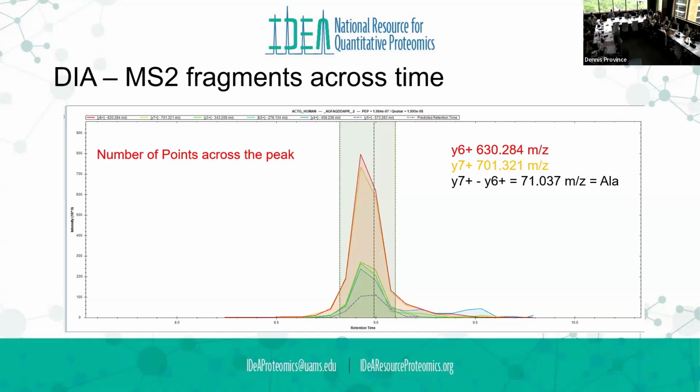So that's identification, but then we're also quantifying by drawing a sort of Gaussian curve across there. So the question in DIA is, how many points across the peak do you have? And this is where we get all side-eye at Thermo, because when they go to sell an instrument, it's not the engineers that do this, it's the salespeople. They'll do the settings, so it's really great for identification. They get 12,000 proteins in every run, but they only have 1 point across the peak. How are you going to quantify with 1 point across the peak? You don't.